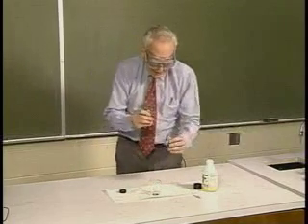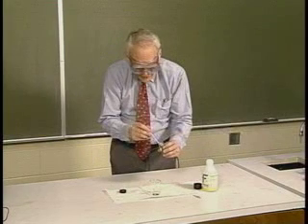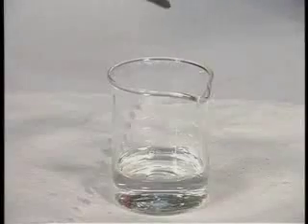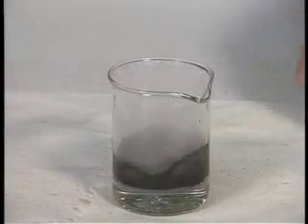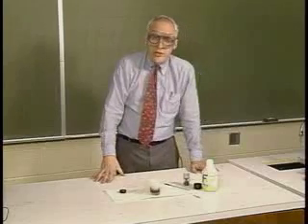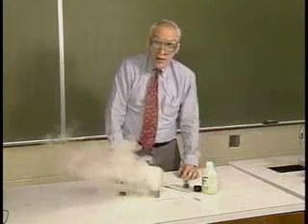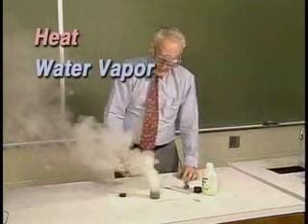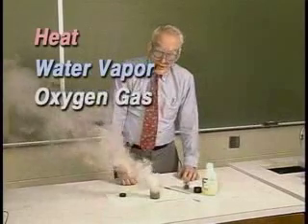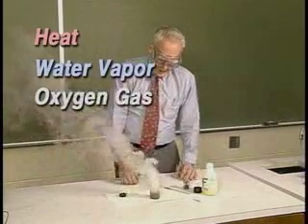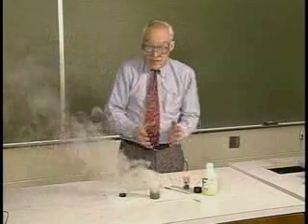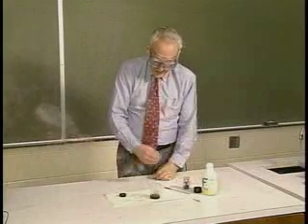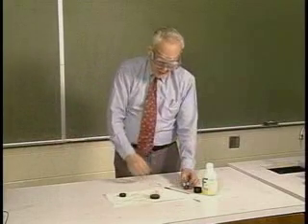The manganese dioxide is a catalyst for this reaction. So if I put just a tiny amount — just a pea-sized amount — into the hydrogen peroxide, you'll see that it speeds up the decomposition of the hydrogen peroxide in an almost violent way, producing quite a bit of heat. It's very hot, producing water vapor and releasing oxygen gas into the air. But in all this process, the manganese dioxide is not consumed — it's still there in the bottom of the beaker, sitting on the bottom of what now is mostly water.